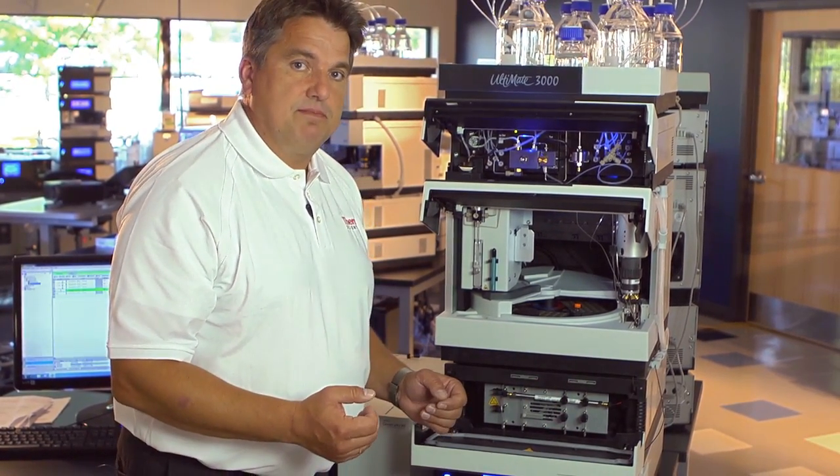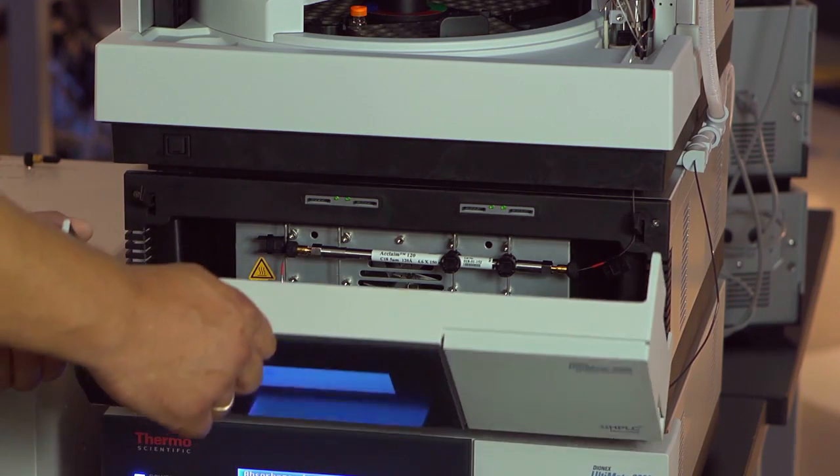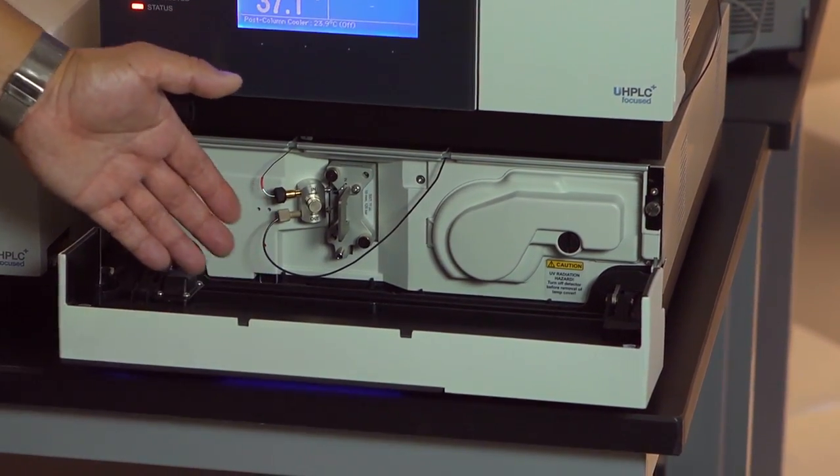Lots of space and very short connections. We also have the chance to put in multiple columns if we want to. From the end of the column we are very fast down to our detector, making sure the peak dispersion is as low as possible so we can maintain the sharp peaks we achieved on the column.